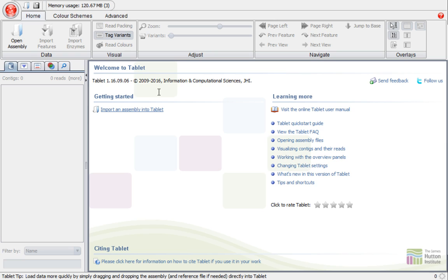I'm going to paste in a URL. This is a local URL for Dundee University on our teaching server. It's not accessible off campus, so please don't try, you won't get to it. And I've pasted in the address for the BAM file. This is a sorted, indexed BAM file. You have to work with a sorted BAM file with the appropriate index so it can find the data and access it in a credible manner. You do need the .bai file in the same location as the original BAM file.